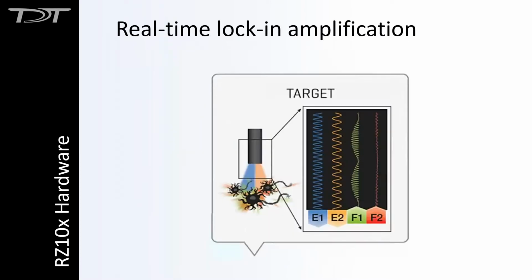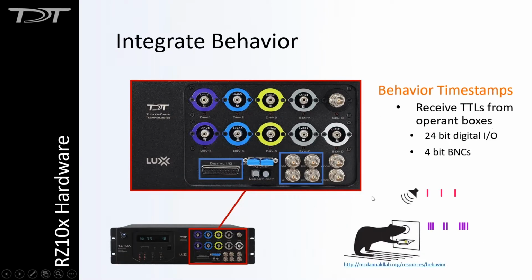Just generally, if I go back to the digital IO, that's not just for behavior, you can send and receive any TTL triggers from this. So that would be my suggestion, but I would have to see if your software has a hardware output where it can send out a physical TTL. We could then connect it to one of these interfaces, and then you can use that to control your recordings in that route.